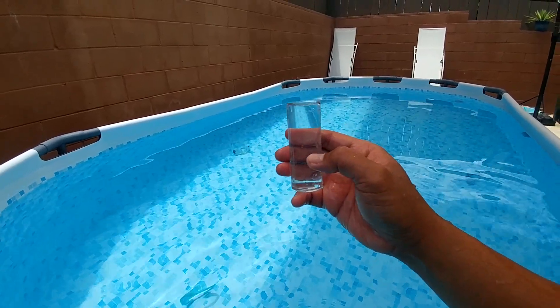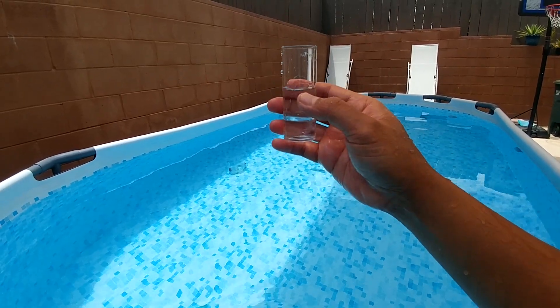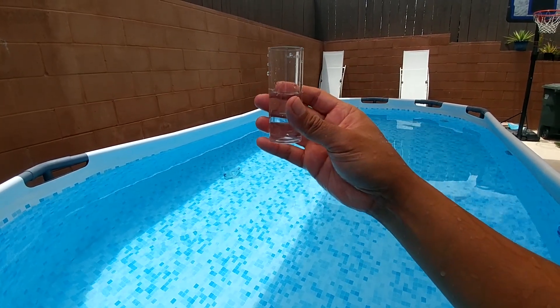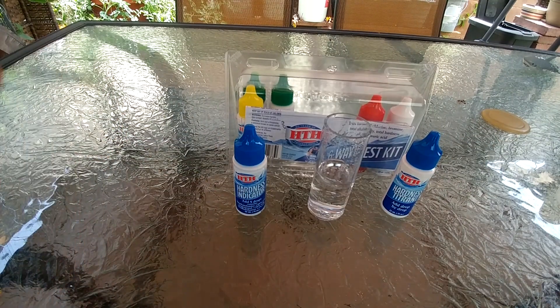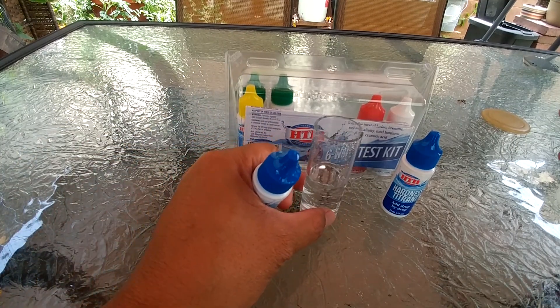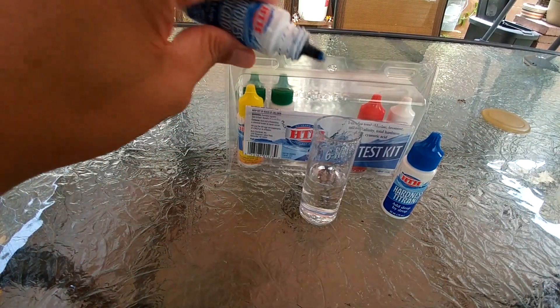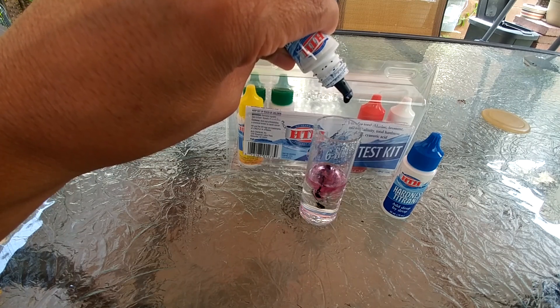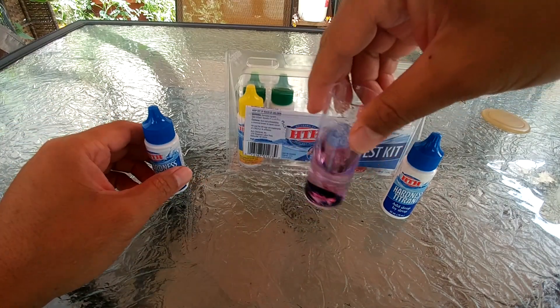Let's remove some water so we only have 25 ml. To test for hardness you want to add five drops of the hardness indicator. Your water should turn red if you have any hardness in your water. Then shake it.